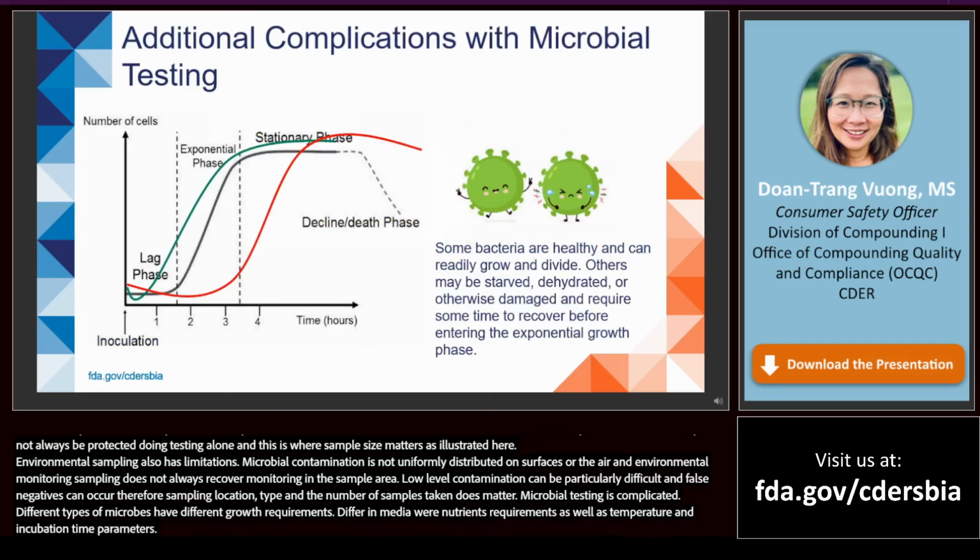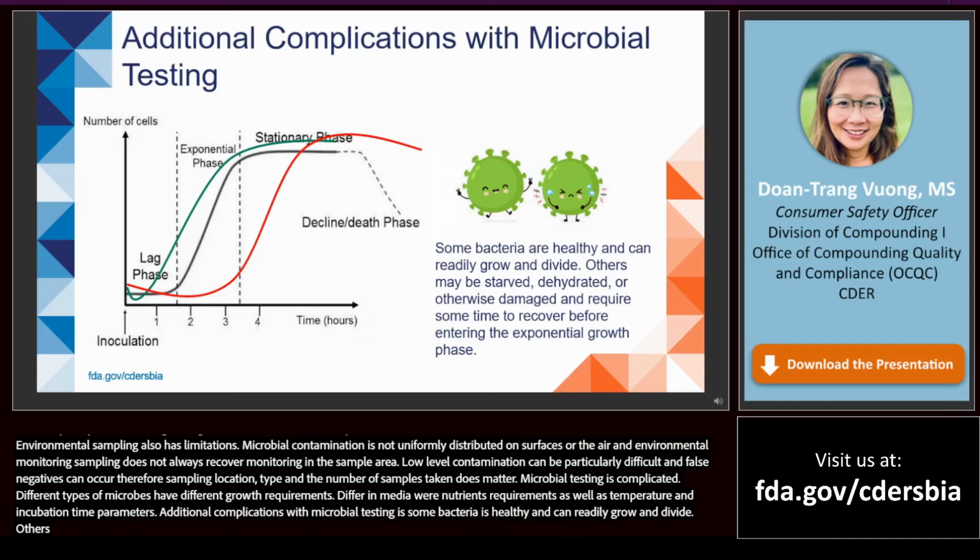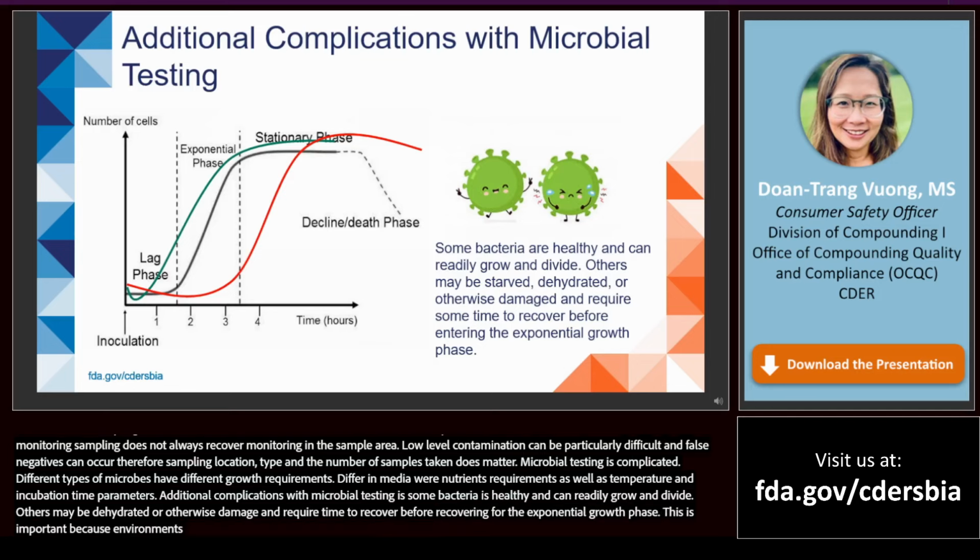Additional complications with microbial testing: some bacteria are healthy and can readily grow and divide. Others may be starved, dehydrated, or otherwise damaged and require some time to recover before entering the exponential growth phase. This is important because the environments in our clean rooms are designed to be hostile to microorganisms, denying them essential nutrients and water while subjecting them to harsh disinfectants and cleaning materials.